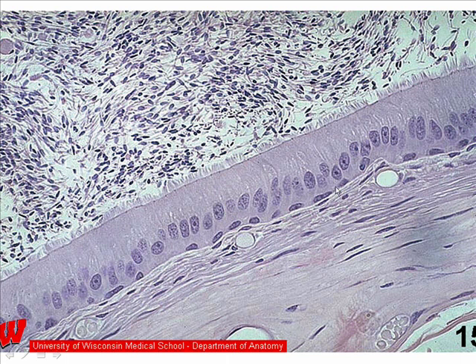These are the stem cells for this epithelium, and they touch the basement membrane, which is a pale staining layer just here, but they do not touch the apex, whereas the columnar cells touch both the basement membrane and the apex. So this is what we call a pseudostratified columnar epithelium, and we need to further define it, as you learned about in epithelium lecture, by the apical modifications that exist upon these epithelial cells.